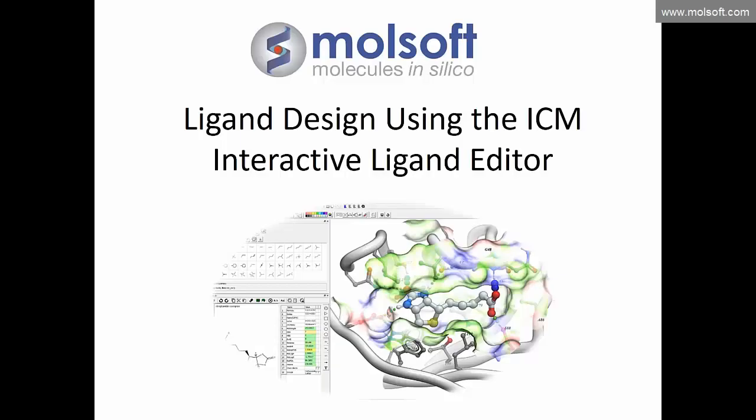It's 9 o'clock here in San Diego, so we'll begin the webinar. Today's webinar is on ligand design using the ICM interactive ligand editor.